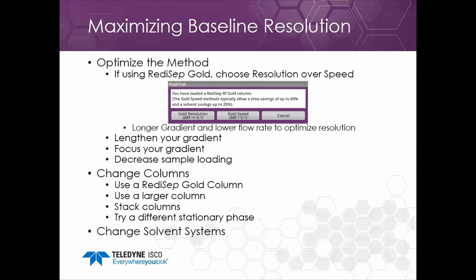Another change you can make is changing your solvent. So, traditionally hexane ethyl acetate or heptane ethyl acetate, or your traditional base solvent system that you start from, maybe going to DCM methanol or DCM and some other solvent may be a better choice, or changing to a toluene solvent, which you can do now with our NextGen system with the baseline correction, or choosing acetone.